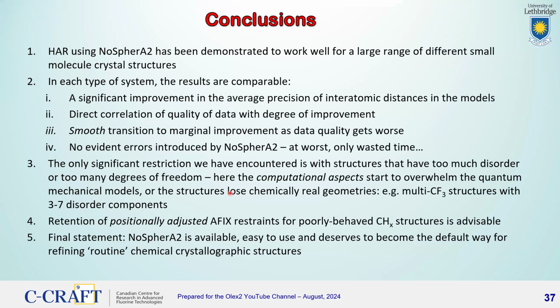In our experience, NoSpherA2 has been demonstrated to work well for a large range of different small molecule structures. I've shown you organic examples, metal organic examples, non-metallic phosphines and things like that. I've shown you some thiazyl main group compounds. I've shown you conventional transition metal coordination compounds, and in each case, the results are comparable.